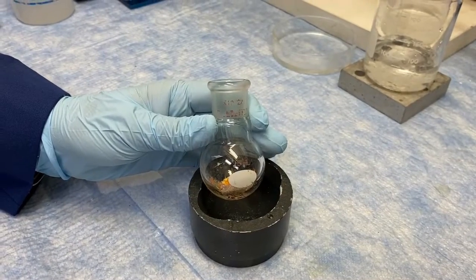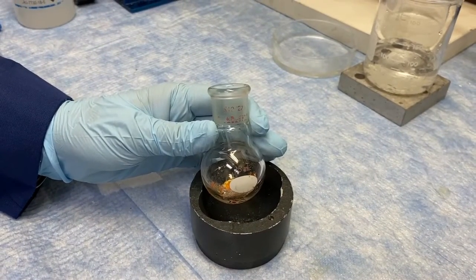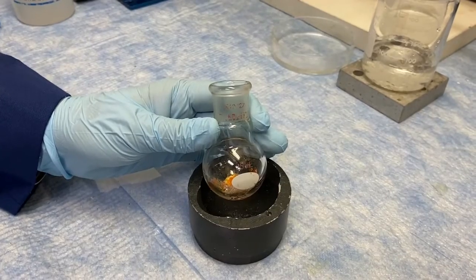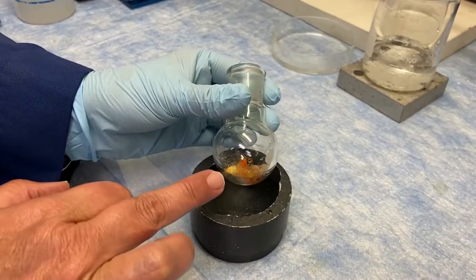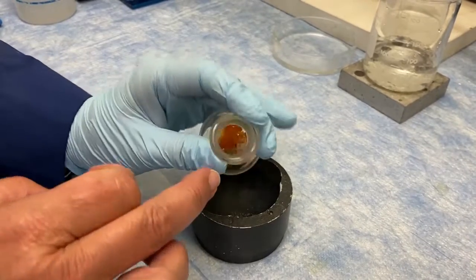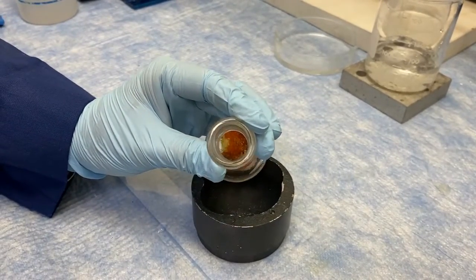Okay, so we've added the ortho-vanillin and the toluidine. The toluidine is this brown over here, and you can kind of see a little bit of this yellow over here. That's the ortho-vanillin. This is what we call a neat reaction, and so this is really cool.